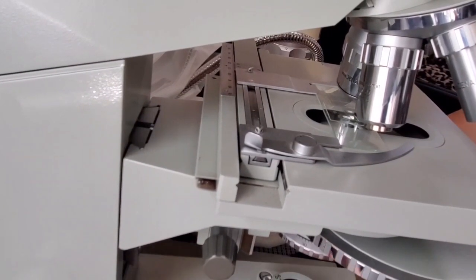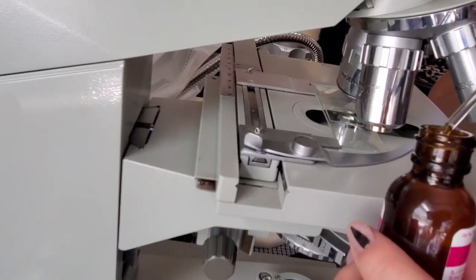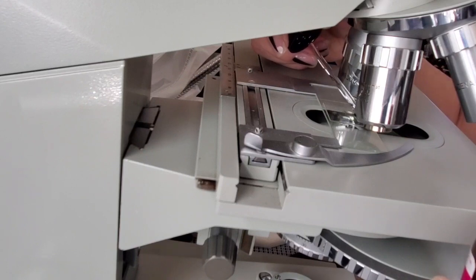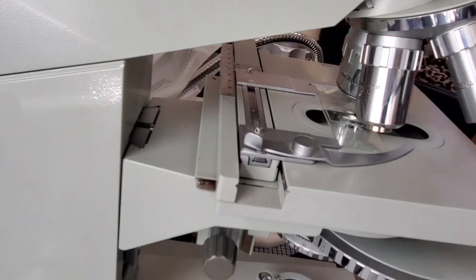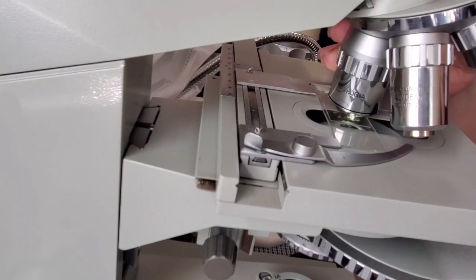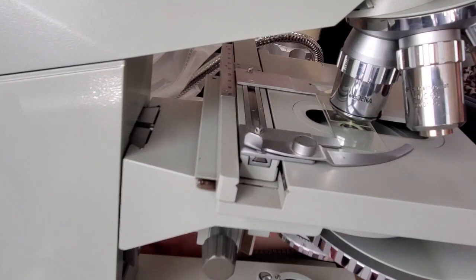just a little bit, and so you have your oil immersion, and you want very little. You don't need the big drop that comes with it, and you place it over where you want it to be. Now you should be ready to slide your oil immersion objective, and then you can slowly move upward.